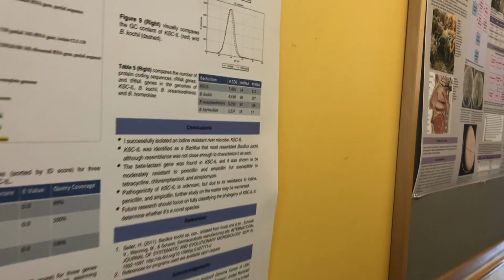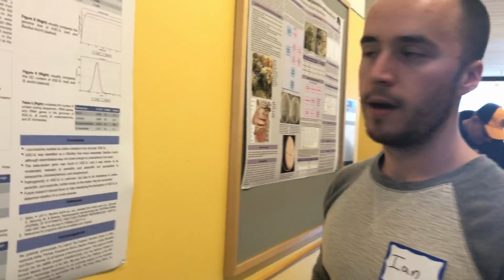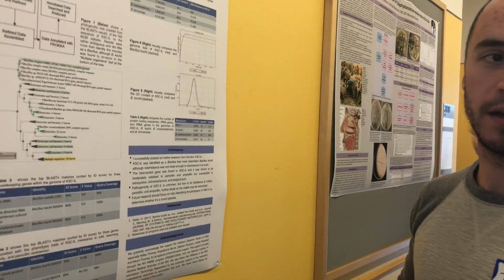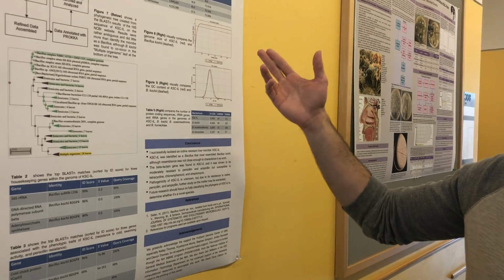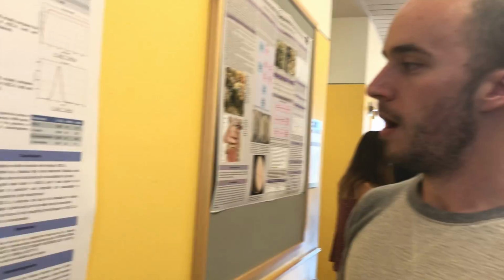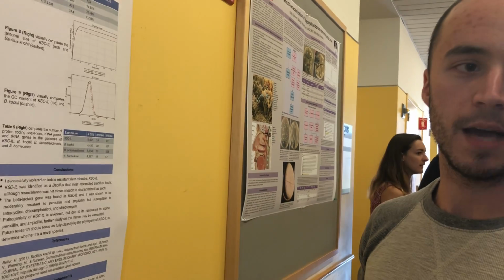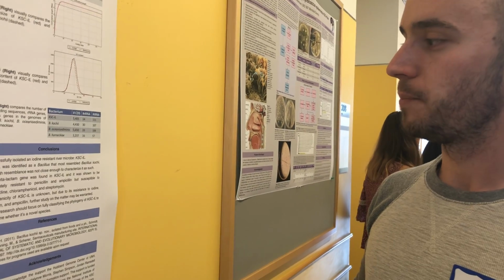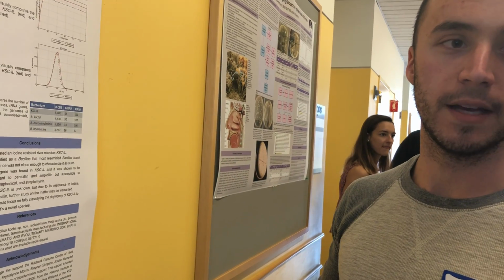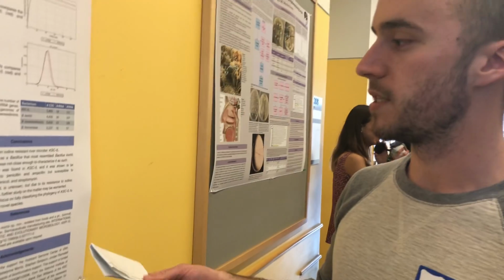So what I conclude after this is that I can't actually identify the microbe I found as Bacillus kochi. It has some characteristics in common with Bacillus kochi, but after comparing the average nucleotide identity, there's no way that I can definitively say it is Bacillus kochi. Due to its antibiotic resistance to penicillin and ampicillin, it's hard to say whether or not it's pathogenic, but it is important to know if it is pathogenic because it might potentially be hard to treat. It's also resistant to iodine.